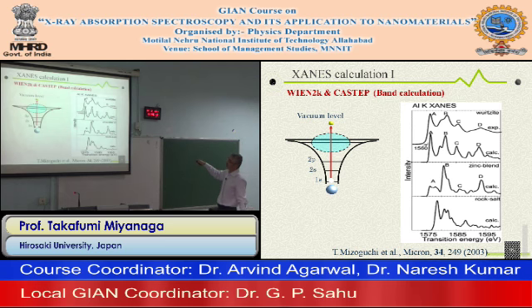This is the aluminum K-edge. After excitation to the continuum state, there are still some energy levels. So in KKR or some band calculations, the peak intensity is assigned.